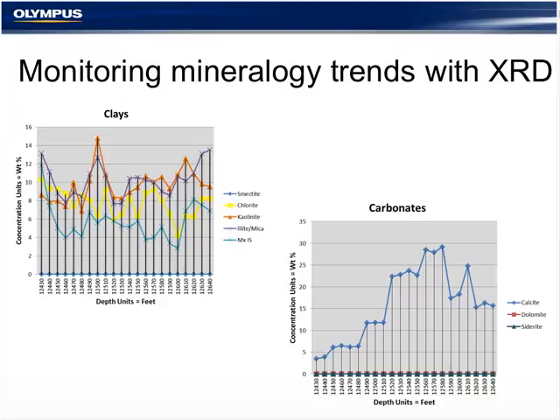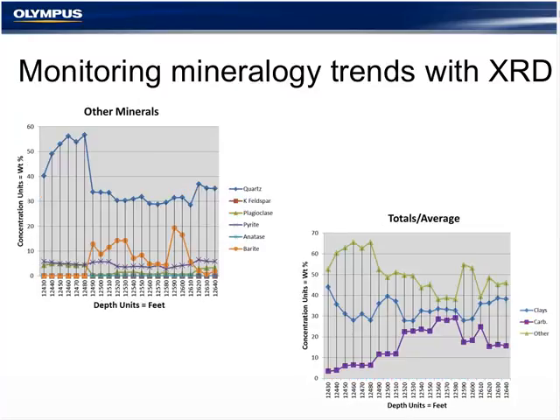Not only can XRD be plotted on these mud logs next to lithology descriptions, but data can be charted to discover formation tops and trends, and it is especially important when identifying faults. Most shales are highly laminated. This presents a challenge for traditional analysis, as they harbor consolidated and compacted parasequences of shallow marine sediment, clay, quartz, feldspars, and heavy minerals. They exhibit ultra-low to low interparticle permeability, low to moderate porosity, and complex pore connectivity.